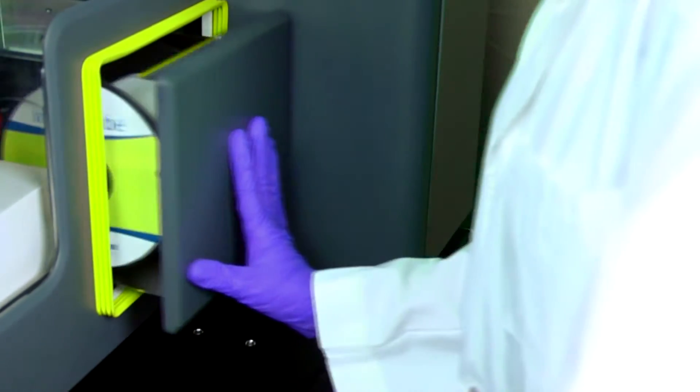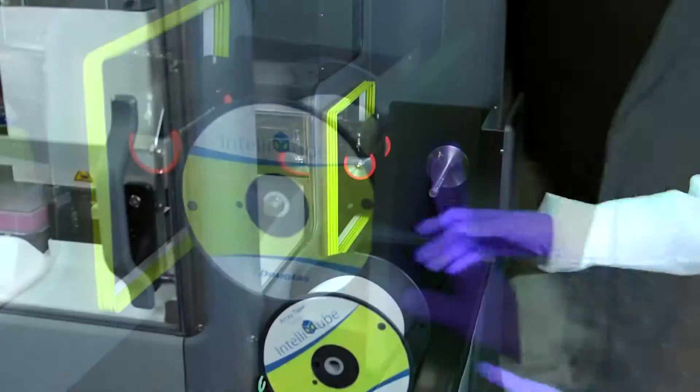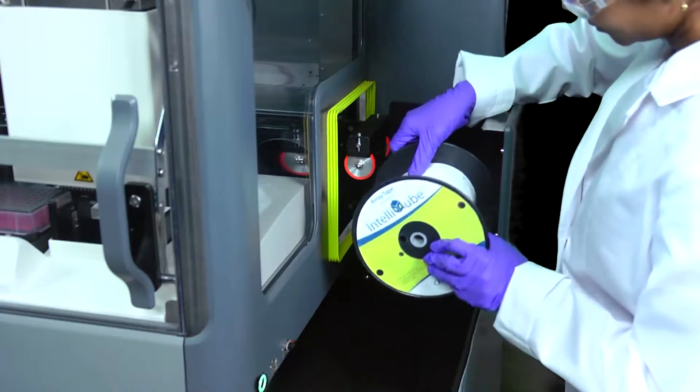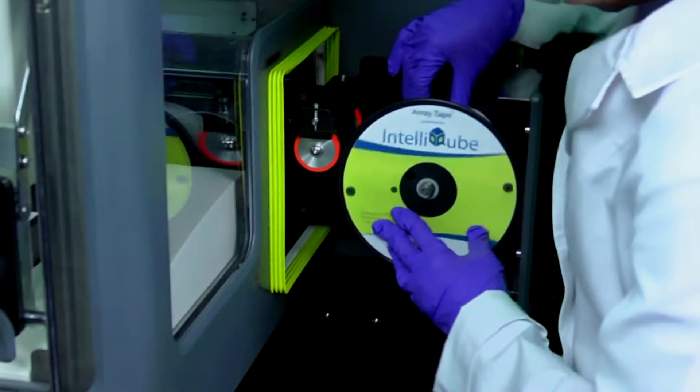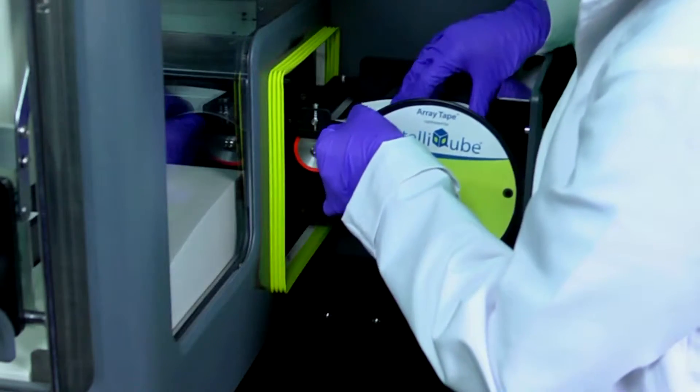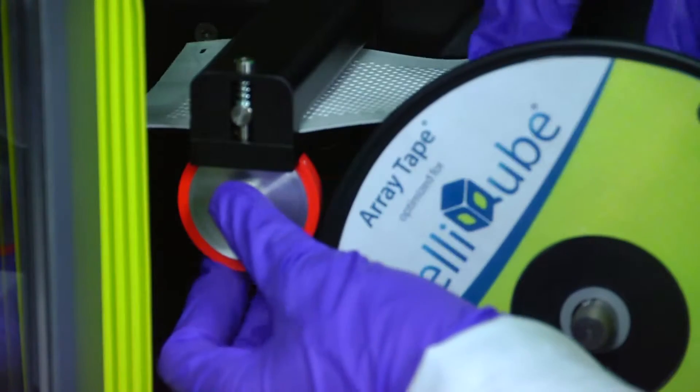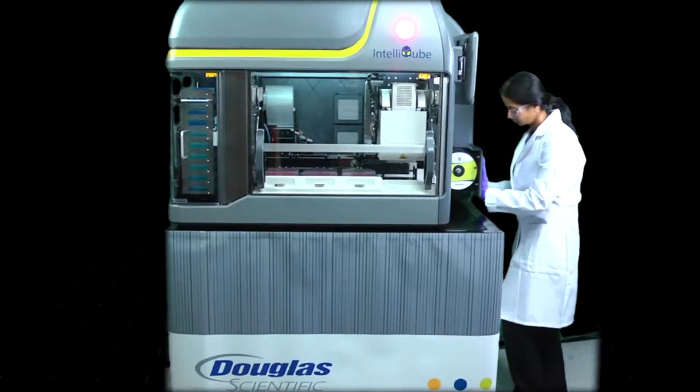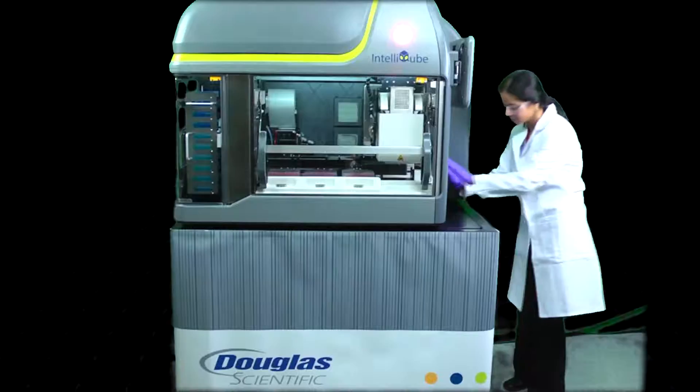The instrument is optimized for use with an opaque white polypropylene Array Tape specifically designed for the IntelliCube. In addition to our standard 384 well Array Tape pattern, our new 768 well interlaced pattern enables even higher throughput.